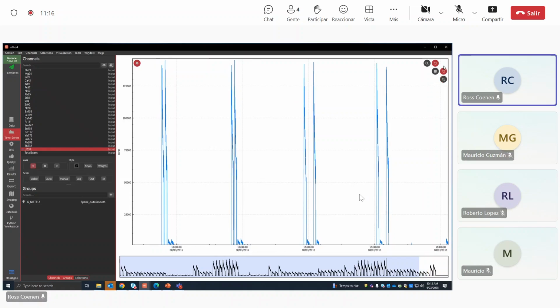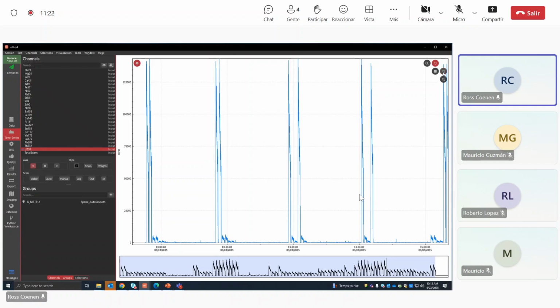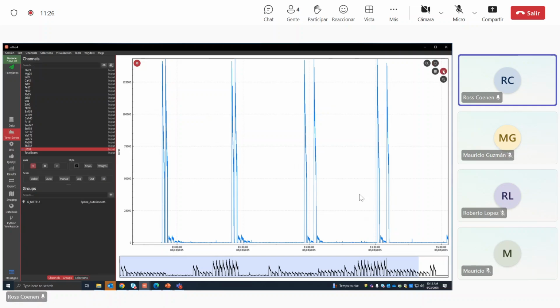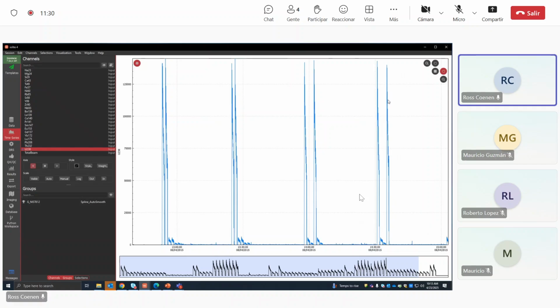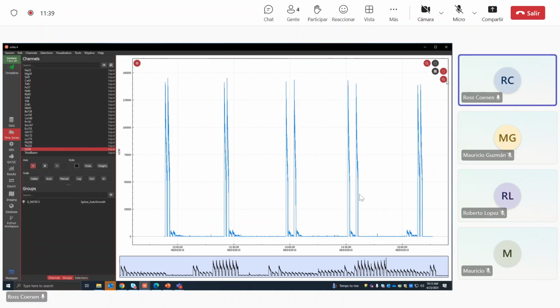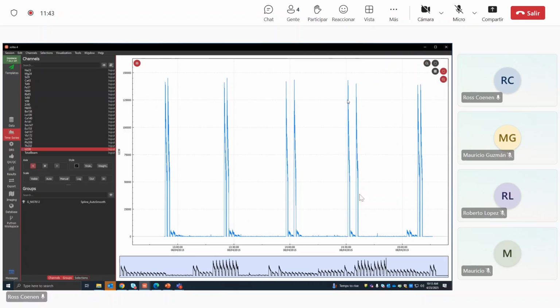And these little controls up here on the right, there's two hands you can use to drag. If you only have one selected, then it'll only go in the x-axis. If you have the other selected, you can move in the y-axis. You can also use the scroller on your mouse. And then to zoom in, same, you can do X and Y, or just X, or just Y.